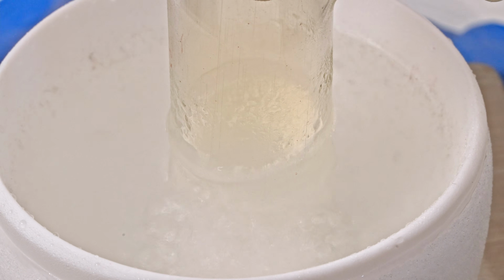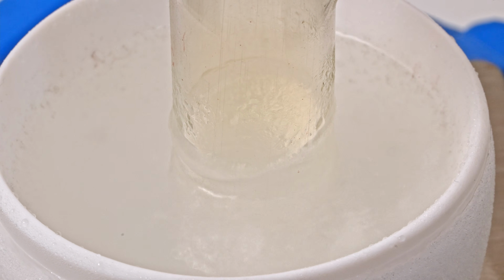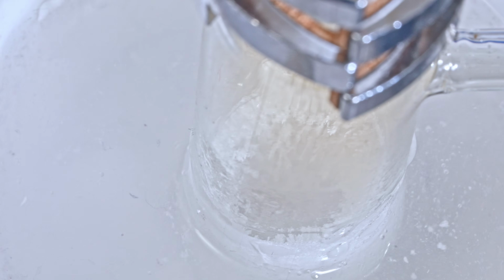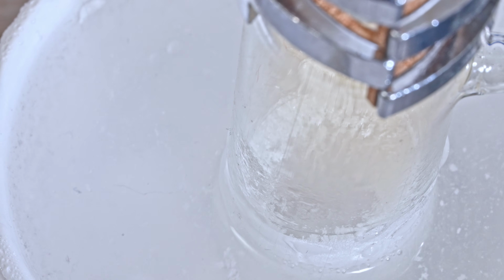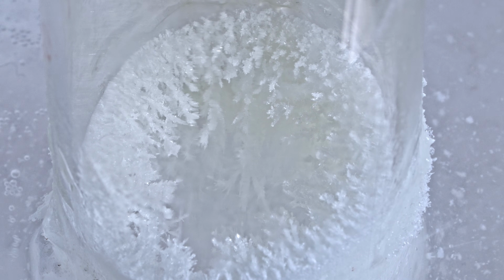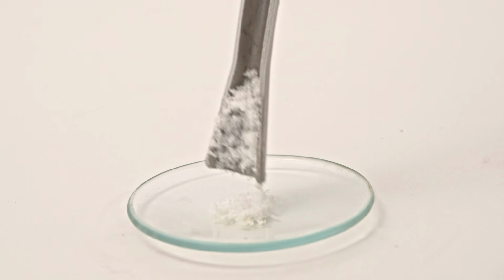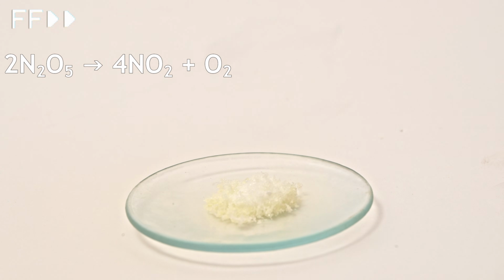After a short while, white needle-like crystals of dinitrogen pentoxide start growing on the walls of the receiver flask. I did my best to find the perfect angle, so you can all see what the crystals of pure dinitrogen pentoxide look like. I hope a photo of these crystals will soon appear on Wikipedia. At room temperature, dinitrogen pentoxide quickly turns yellow as it decomposes into oxygen and orange-brown nitrogen dioxide.